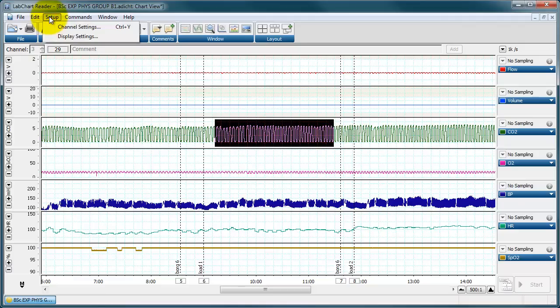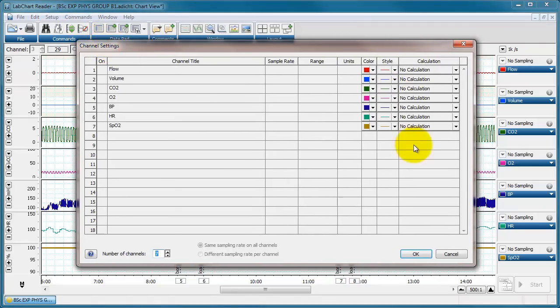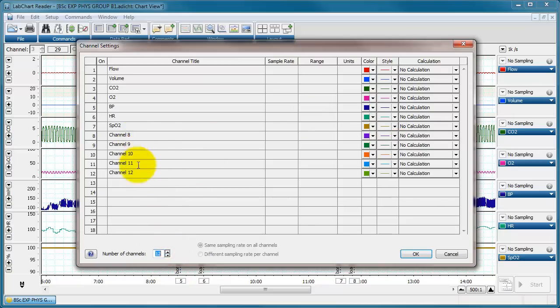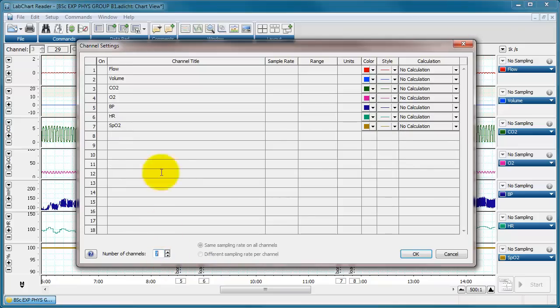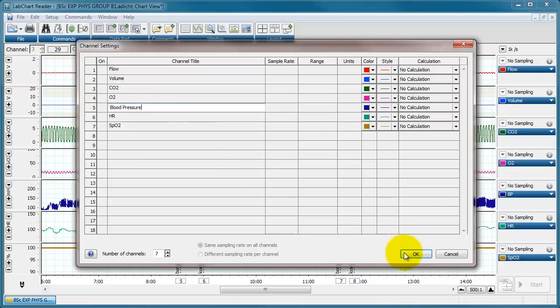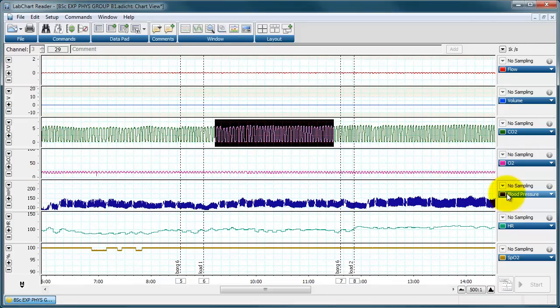In the Setup menu, you can change display settings and channel settings. The channel settings box is much like what you see in LabChart when setting up an experiment — you can add or remove channels, change their colour, and add calculations to your data. You can also relabel channels; for instance, I can relabel 'BP' to 'Blood Pressure' and now the channel shows the full label on screen.